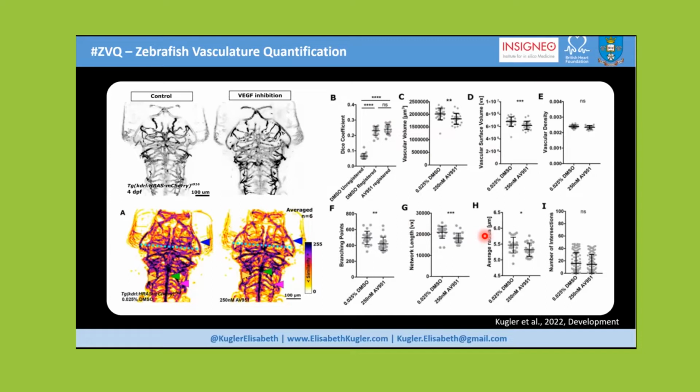And again, this is something that shows us clearly that this is where you need computational analysis. I, as a human, would maybe have spent years just looking at these data and trying to find some differences. But now with this workflow, I plug it in, it probably takes a day or 2 to run a complete data set. And then you get these data and they will objectively tell you where the differences are within your network. And so this is really just one example, but like I said, we have tested it on various different applications, just to see where the limits are, what we can extract and what we can't extract.